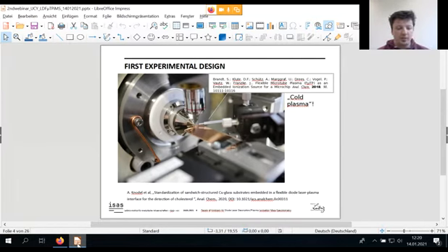Nevertheless, in comparison to the DBDI, which was a glass capillary, just to recall real quick, with two electrodes around this glass capillary and dimensions of about 1 millimeter, the flexible tube has only an inner diameter of 250 micrometers. So we're getting really, really small with these plasmas, and we can get really close to the inlet, which is quite cool, because you do not need any transportation line or any heated capillary to get the ions or the neutrals to the MS inlet somehow.